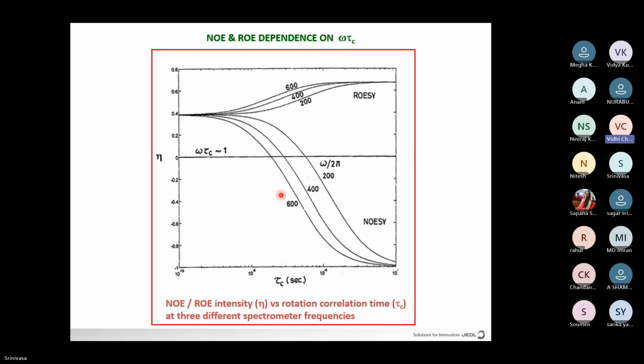One thing, Srinivas ji, some people here also do NOESY experiments at variable temperature, meaning someone says they want to do it at 30. Yes, you can do that. But the only thing is, when you go to a high temperature, whatever the temperature is, you have to make it stabilized. After achieving 30 degrees or whatever the temperature, you have to wait at least 10 to 15 minutes so that whatever temperature gradient is present in the sample goes off. Then only we'll get a proper signal. But we can do NOESY experiments at high temperature. Yes. Okay, thank you.